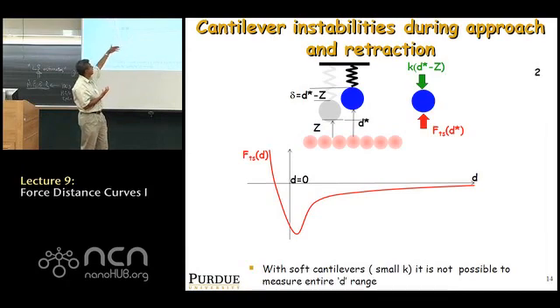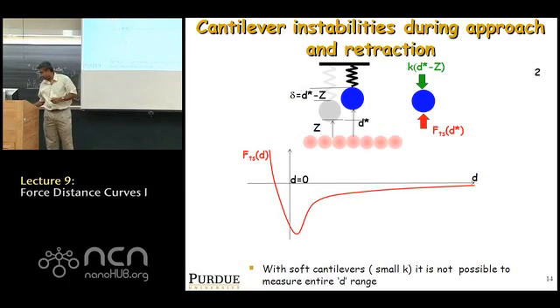And it's not straightforward because while the force on the top shown in green is linear with respect to D, the force at the bottom is a very complicated function of D. So at every Z, you have to balance these two forces to figure out at what D they balance out. And we can study this graphically as follows.